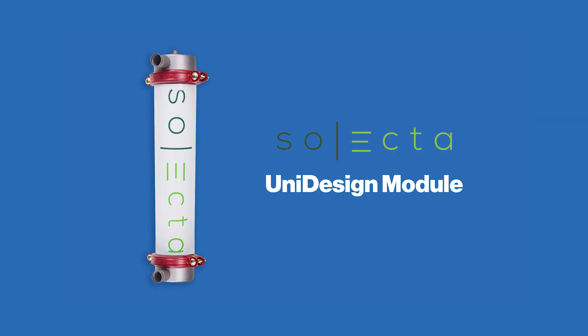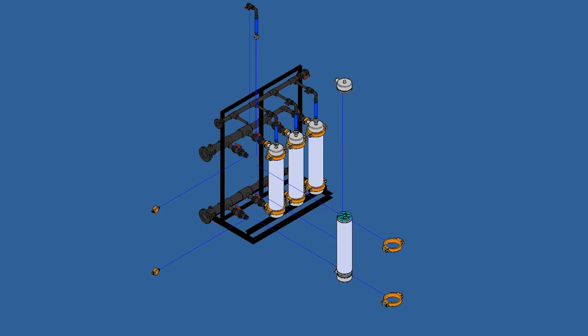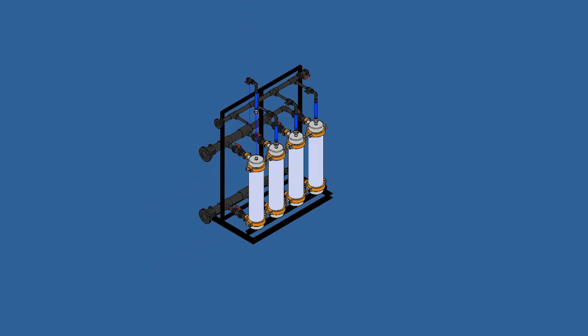Because the integrated element in housing has 24% more membrane area, our UniFlux system has a smaller overall footprint and provides more permeate flow. With fewer parts, the module is faster to install and has less risk of mechanical failure.